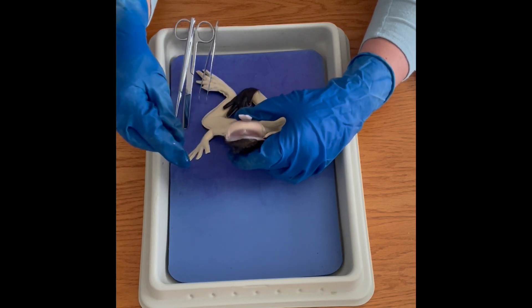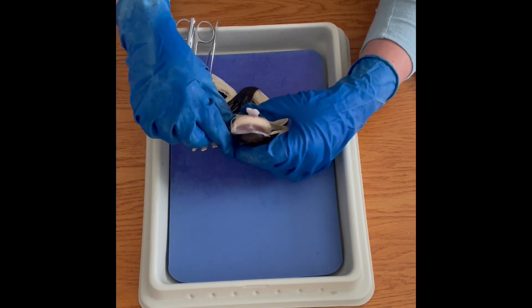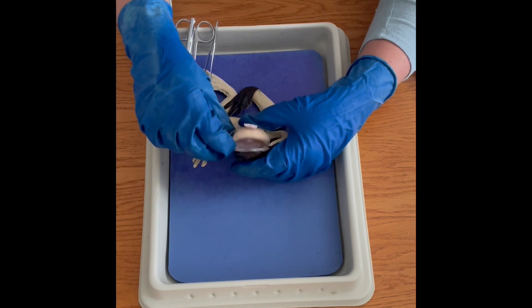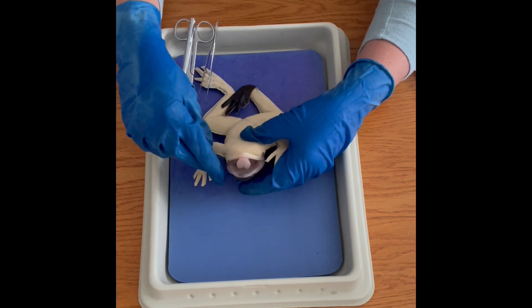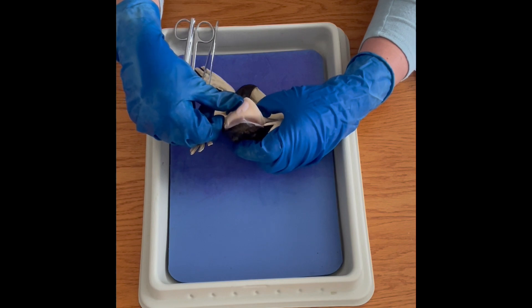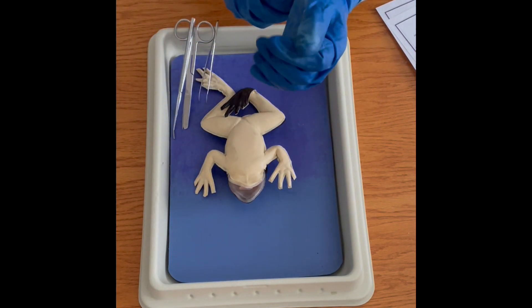You can see the eustachian tubes in the mouth. The teeth are not as obvious as a real frog's would be, and that is one of the things I do have students identify on the lab dissection with the real frog, so that would be something that would need to be modified. But other than that, it's fairly realistic.